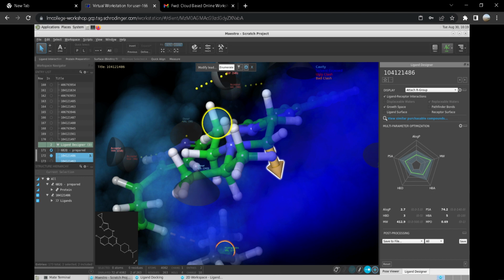So for example, we got these results here. If I click on this particular molecule, that is one of the results from this ligand designer, just hold on. Yeah. So if I click on this particular circle right now, you can see the change that happened in this cyclopropane group here. Okay. So the same way you can take a look at the other groups also. You can click on this particular circle, so you can see the changes that are happening in that region over there.